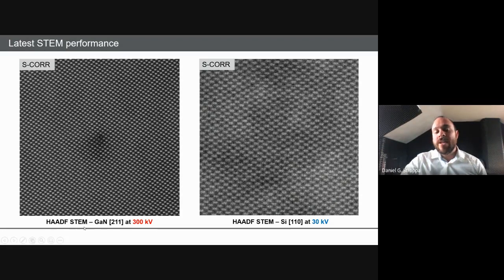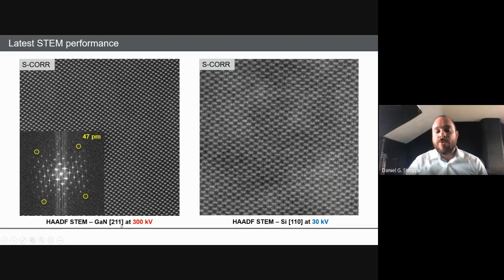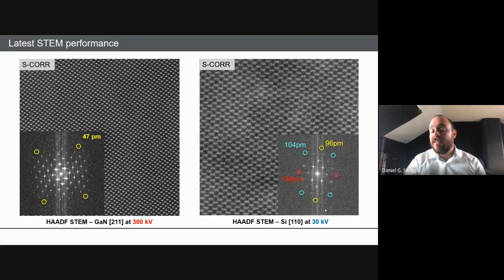And well, this is where we are in terms of resolution. I'm not going to comment much on it. I just want to share where the TEM can get in terms of resolution today with the correctors. And of course, if we make a small probe, you can do chemical mapping locally. So here's a chemical map with atomic resolution.